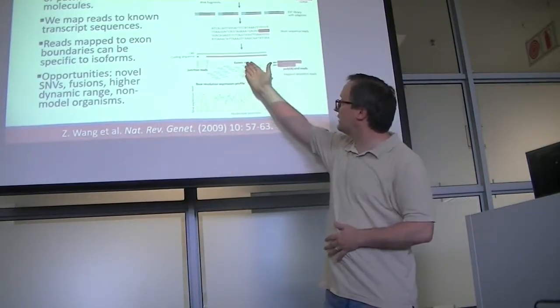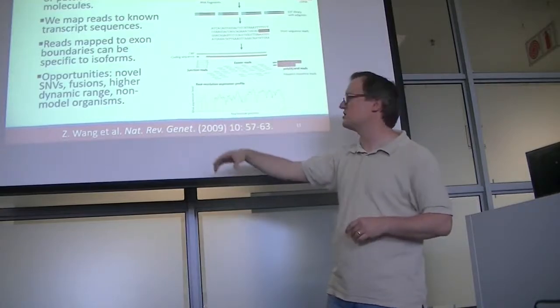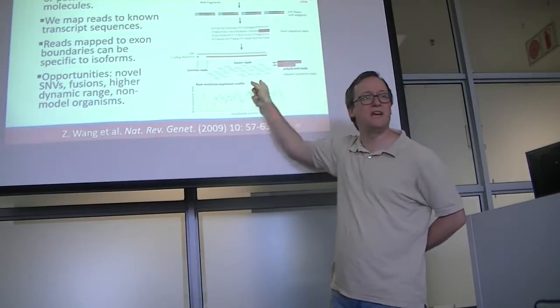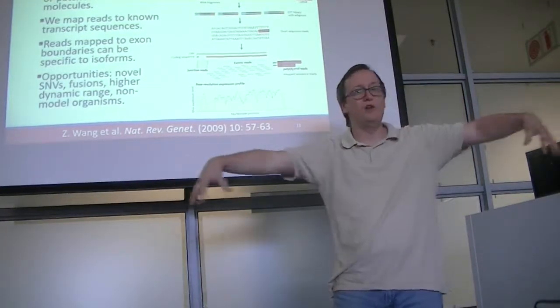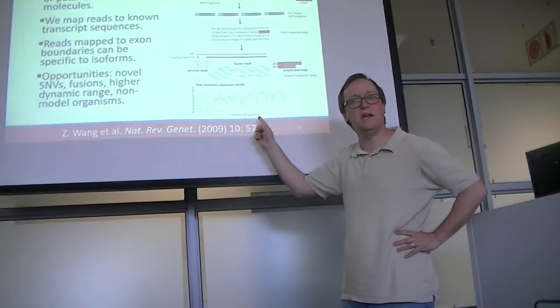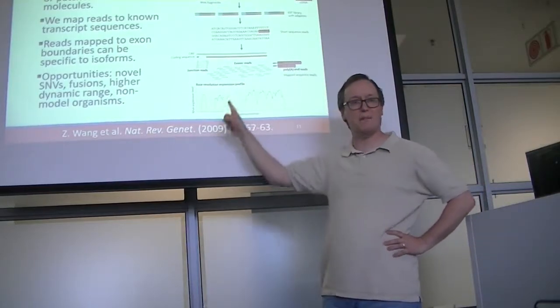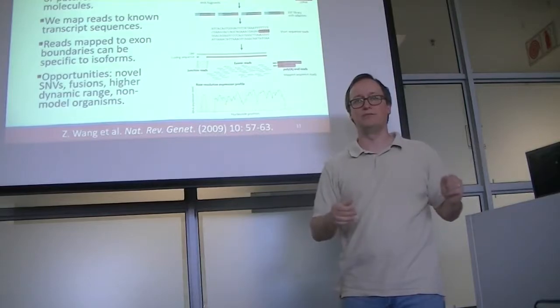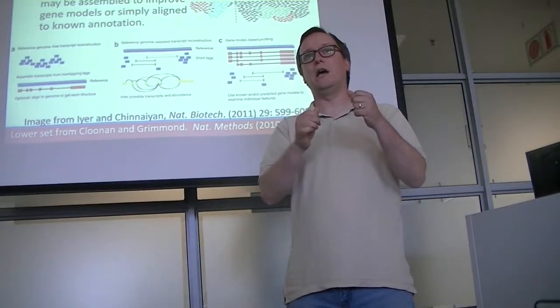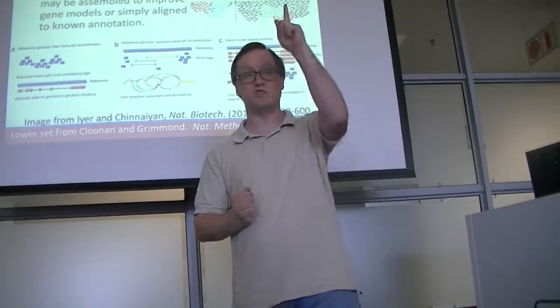All right. The other thing I was going to point to is just the very bottom part of this figure, which is to say we have an open reading frame for some organism. This is just one particular gene, one particular open reading frame for it. We have a whole spray of exonic reads, and as you can see, they're spread all over the entire length of the open reading frame here. As a result, we get a coverage map to say what nucleotides in our genome annotation for this gene are covered to what depth as we walk our way across this entire structure. So that's the kind of feedback you're going to get, a base resolved pattern of expression. How many different reads does this particular location in the genome correspond to?